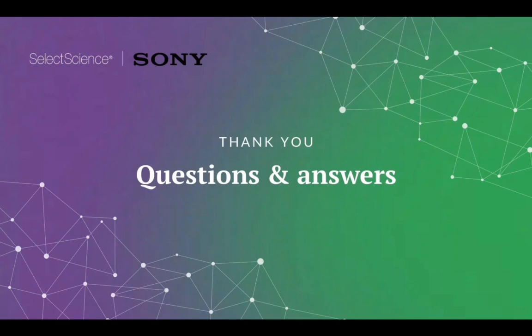Great, thank you. The next question I have says, can you use a mixture of reference spectra from the Spectral Reference Library and fresh single color controls for experiments? Yes, you can, and that's actually a really nice workflow flexibility feature of the instrument. And so what you can do is for tandem dyes that may break down, like I mentioned in the presentation earlier, you can rerun those for your experiments if you experience breakdown of those dyes, and you can pull your non-tandem dyes from the library.